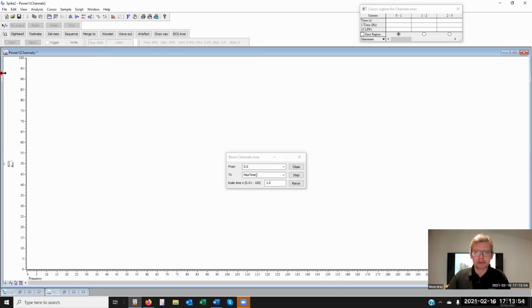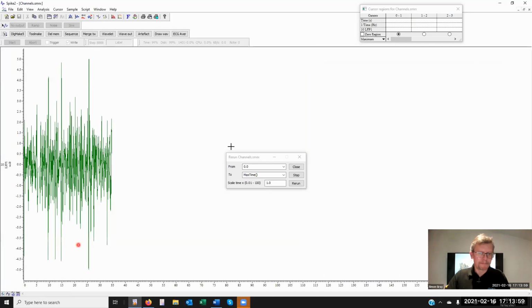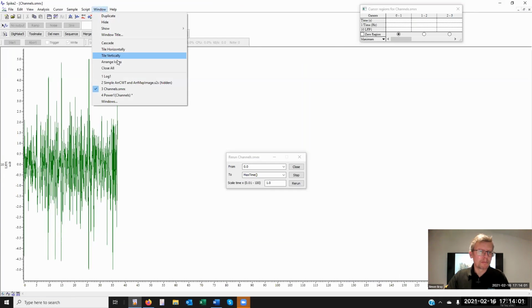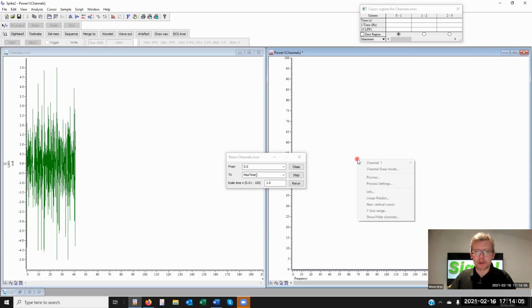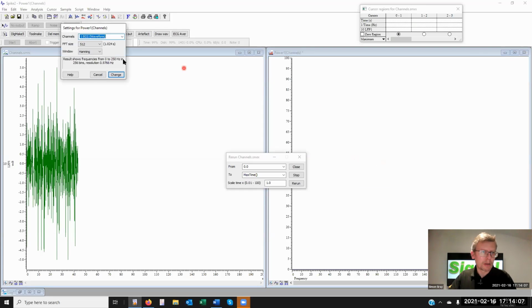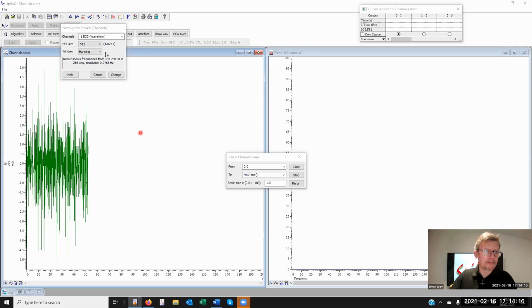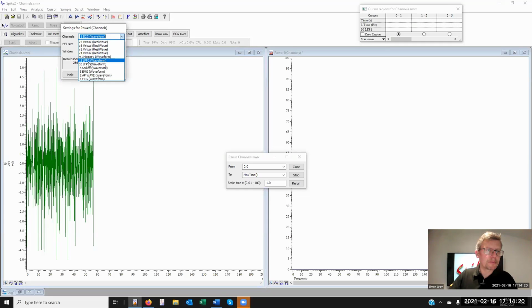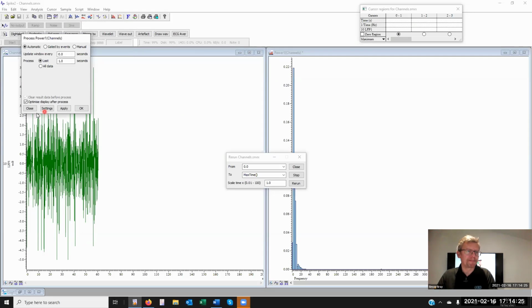What is going on here? Okay, I'm expecting the power window to be updating. 1024, just checking the sample rate here. Okay, so that should be fine. It's channel 10, of course. Change. Right, there we go, power spectrum.